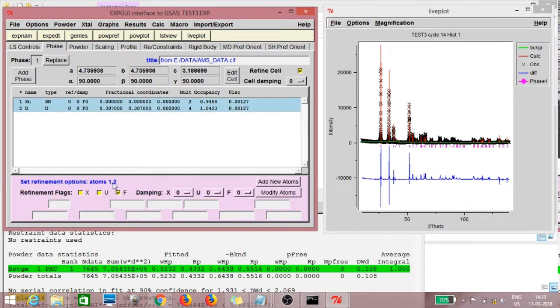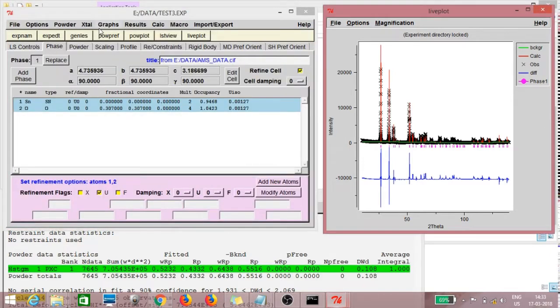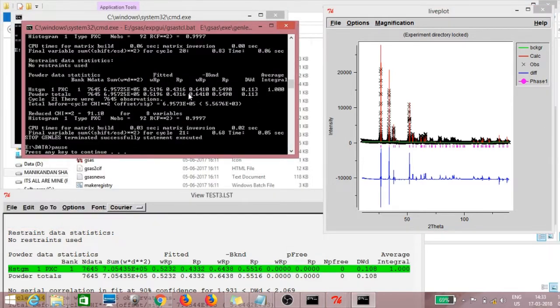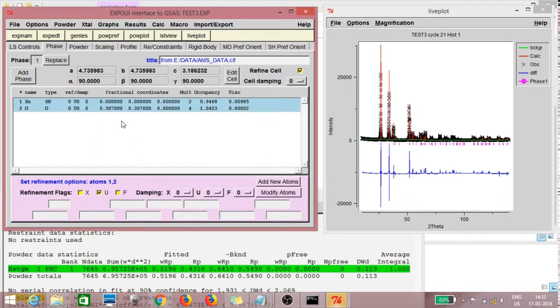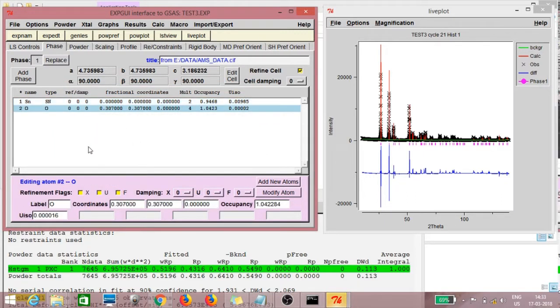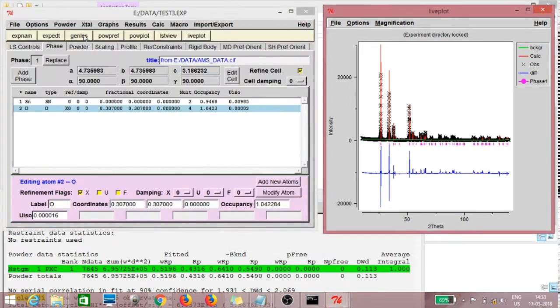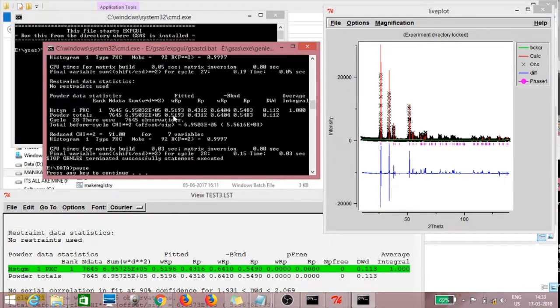Now, parameter. Thermal parameter. Generals. Then second atom alone. Position. 4312.